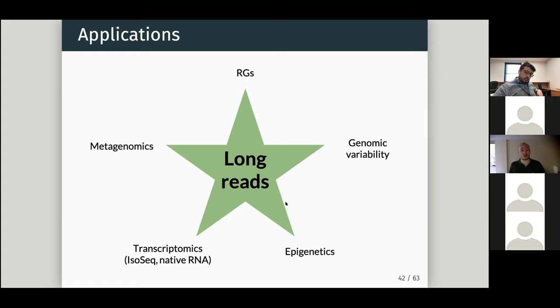And this led to the discovery of many, many alternative splicing combinations and so forth. And of course, metagenomics, if again you're dealing with bacteria, is great because with long reads, you can get very small stuff in a single read, like a mitochondrial genome, or through a few reads, you can get the full length of the bacterial chromosome. And if you have a pool of them all in the same DNA sample, of course you can sequence them all. And instead of having to figure out which short read belongs to which, you have very long reads that can tell you, and you can separate the reads belonging to the different strains much more easily.